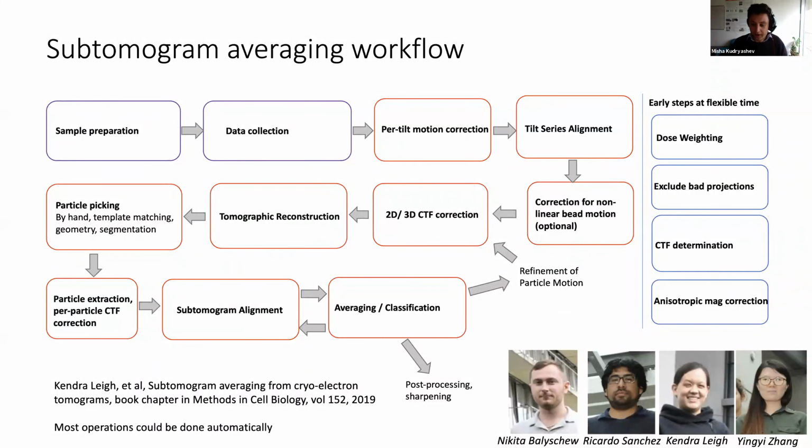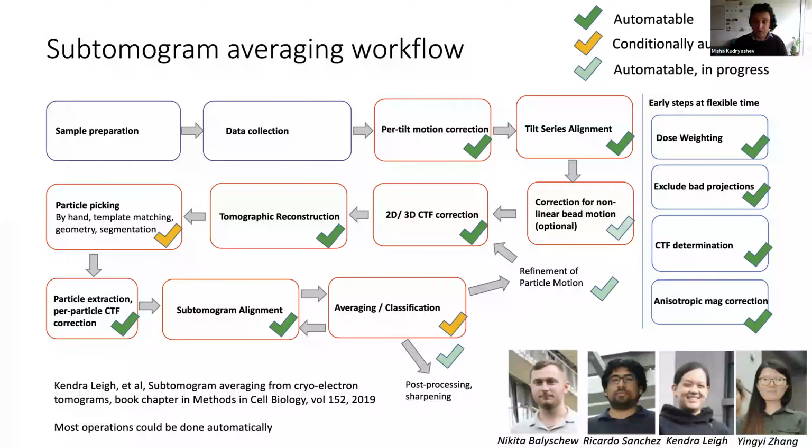semi-automatically, so to say. Right, and so Nikita is a computer scientist, and he put a lot of effort into putting one operation after another in a workflow that a person can use. And so most of the steps we can now automate. I will show you an example later.